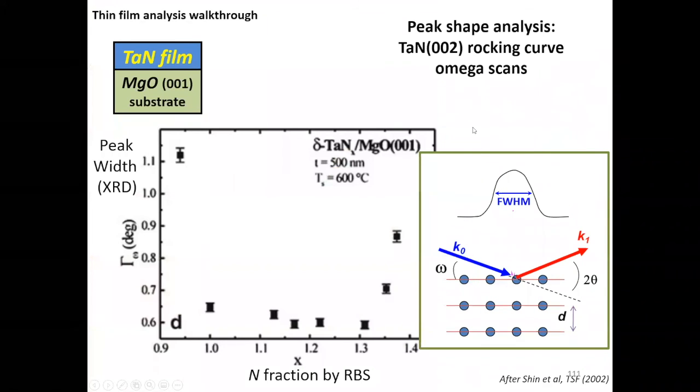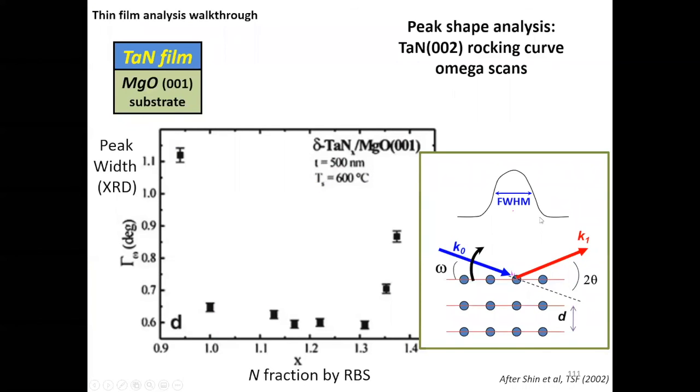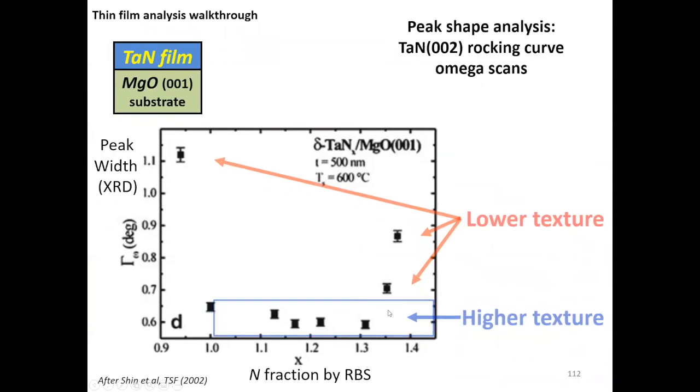Again, the second topic here, especially if you are working with thin film, don't fool yourself that only doing a 2 theta omega scan will do the job for you. You do need to do more sophisticated scans for that. So now, coming back to high resolution. High resolution is a wonderful technique. It lets you see things that are typically buried in the information there.